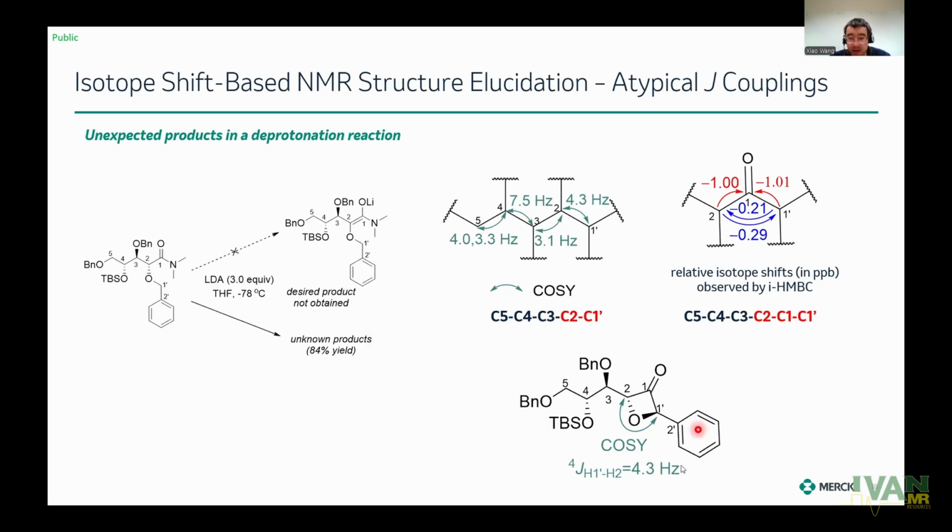This is an oxetanone moiety with a 4-membered ring and an oxygen ether bond here. And this 4 Hertz proton-proton correlation is actually a 4-bond proton-proton correlation here.